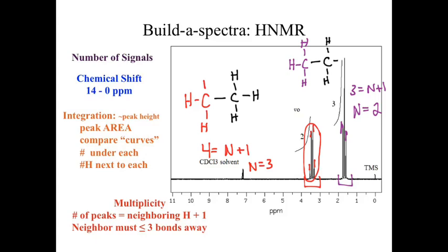I know, we just went through a whole bunch there. What information do I know about that red circle and this red circle? Really, nothing. I don't know much about that red circle at all. In the case of my 2 hydrogen signal, I do know a little bit about that.